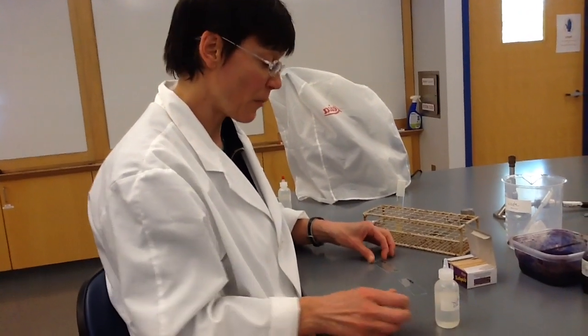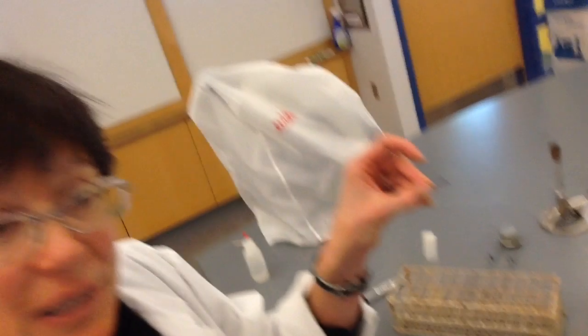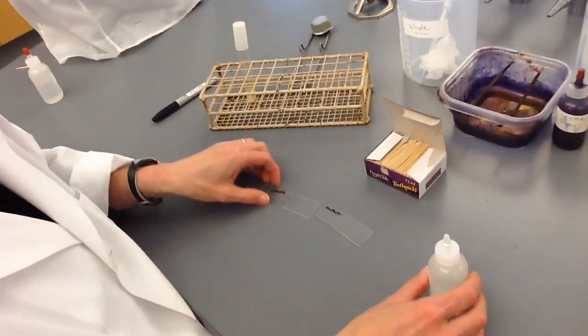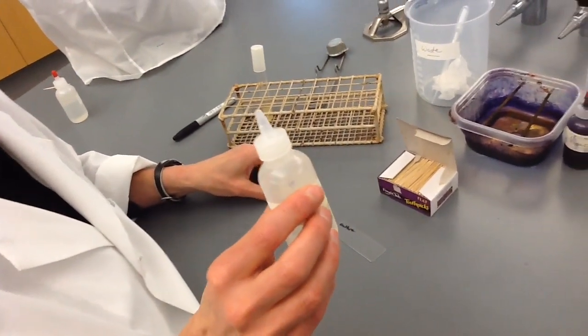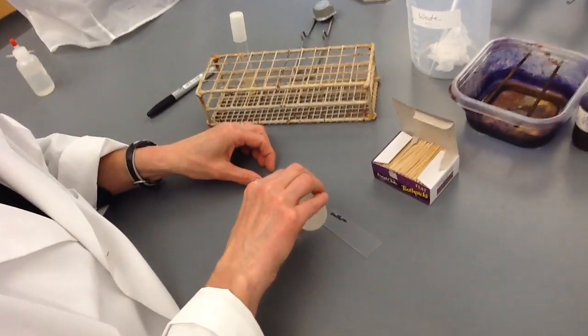First I'm going to show you how to collect the sample from your mouth for some mouth cell microscopy. You start by labeling a glass slide and then you put a drop of water on the glass slide.